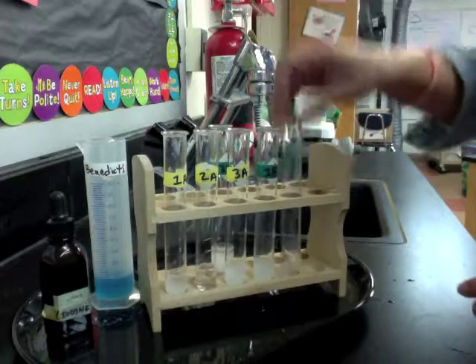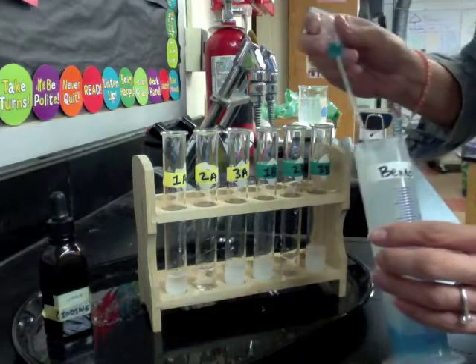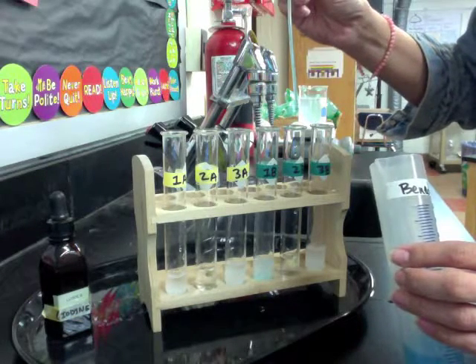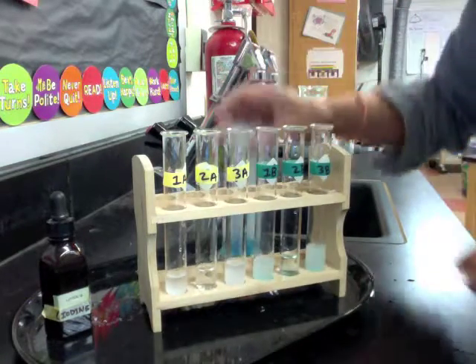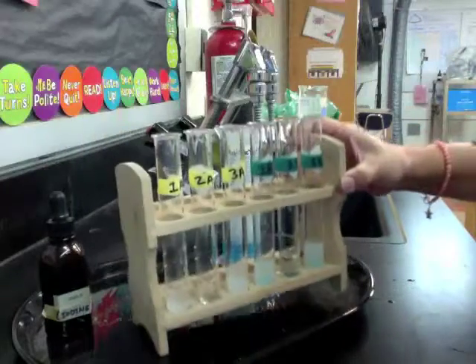So we're going to look at 1B, 2B, and 3B. We're going to add five drops of Benedict's to each of these test tubes. You'll notice that the color is kind of a slightly blue, clear color right now.